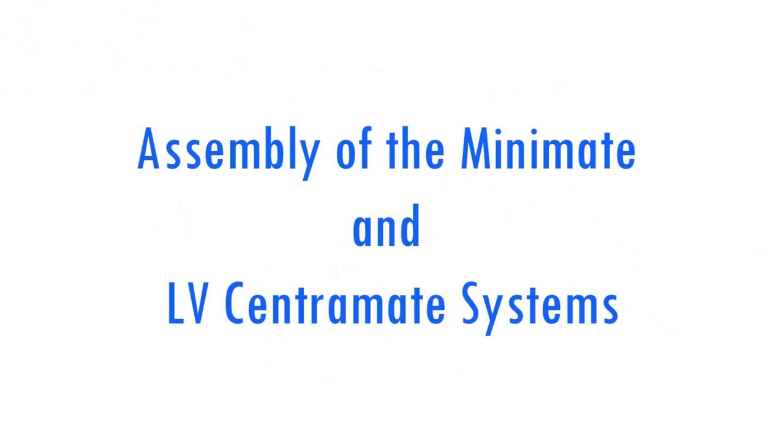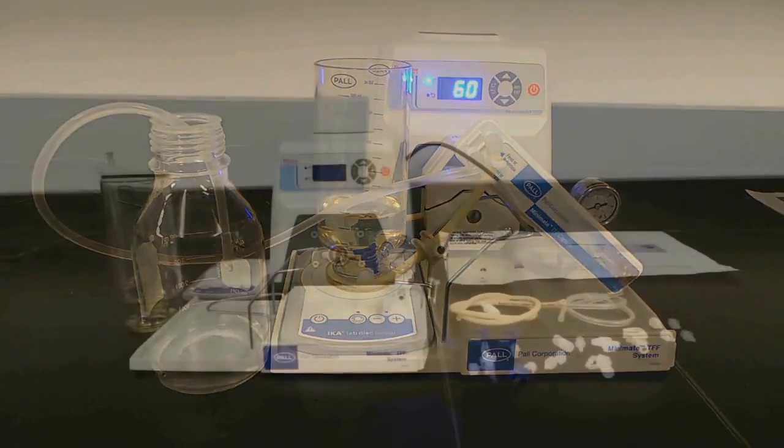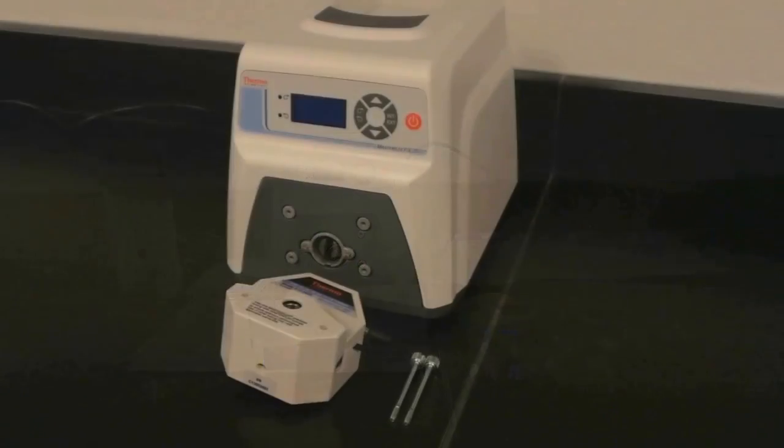In this video, we'll teach you how to set up the Minimate and how to use the LV Centramate Holder with the Minimate system. Start by making sure you have all the parts to properly set up your Minimate system.